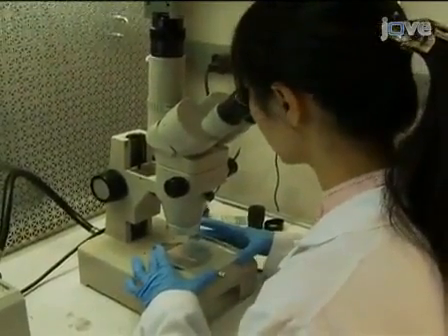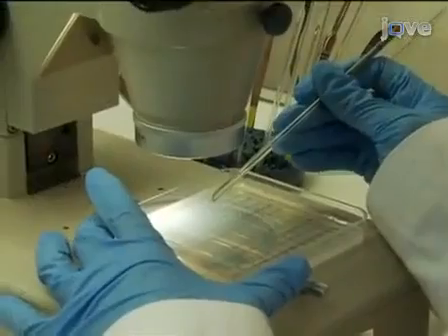Additionally, genetic crosses are routinely used to combine organellar genotypes with particular nuclear genotypes. I'd like to introduce you to my postdoctoral associate, Xingxian Zhang, who will take you through the details of the procedures.